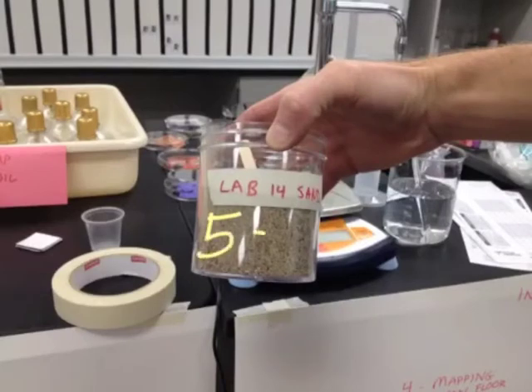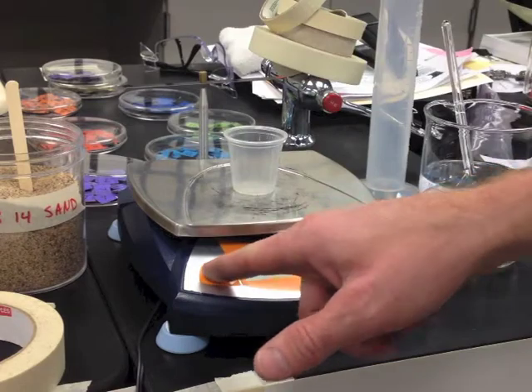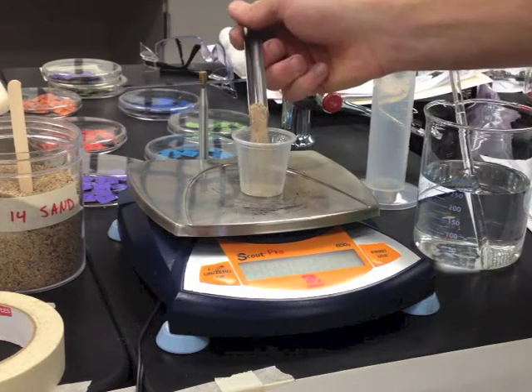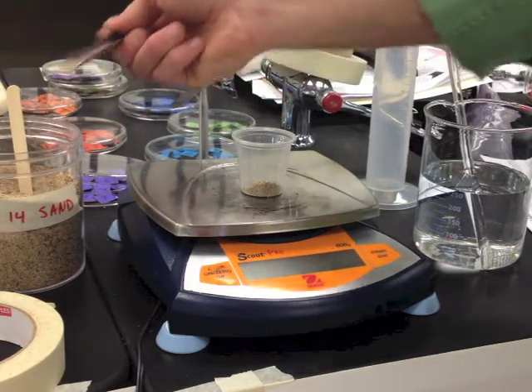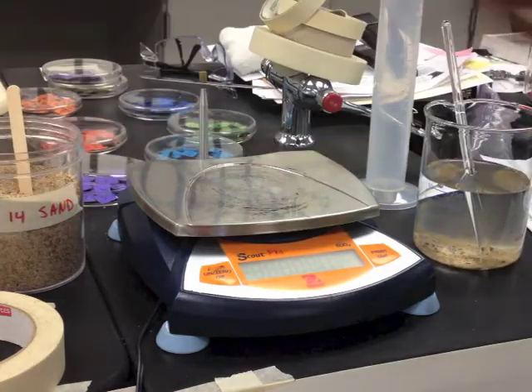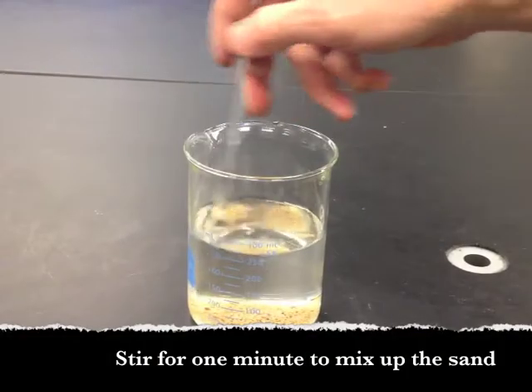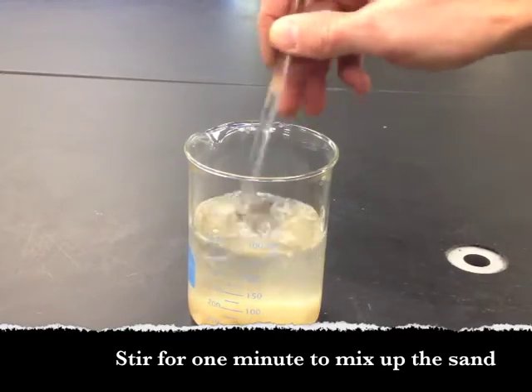Now you need to add 5 grams of sand to your water sample. To weigh out 5 grams of sand, put a cup on the scale, hit zero, and carefully add sand until you get up to 5 grams. I'm at 4.9 — I'm going to call that good — and then I'm going to add the sand right to my water sample. Stir the sand, vinegar, and water sample for 1 minute to dissolve anything that wants to dissolve out of the sand.